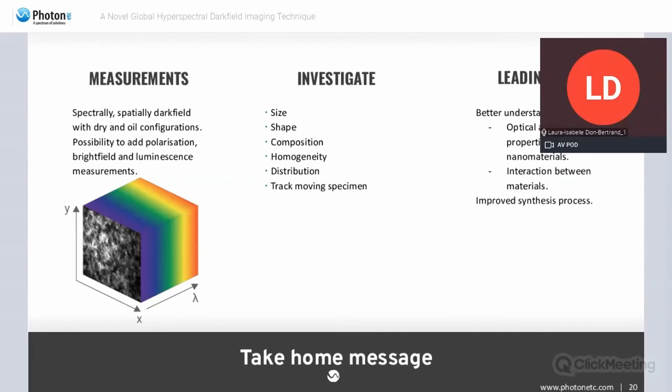To conclude, we presented a new technique based on a supercontinuum source and a laser line tunable filter that we use to perform spectrally and spatially resolved dark field imaging. This technique is compatible with dry and oil configurations, but there's also the possibility to add polarization measurements and to perform bright field and luminescence imaging within the same system. This imager can help investigate the size and shape of particles, but we can also identify composition and homogeneities. And we can also track moving specimens because of the fact that we're doing global imaging.